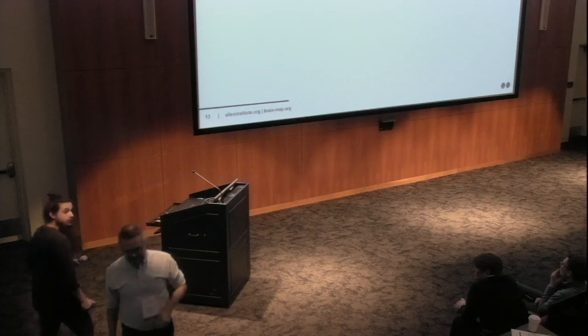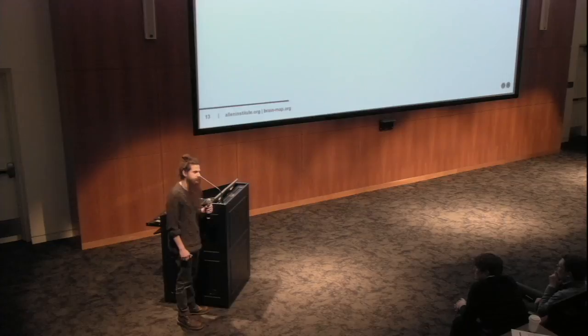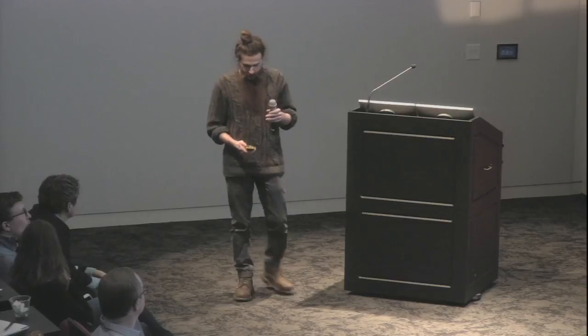Thanks. Morning, everyone. My name's Derek Britton. I'm a systems engineer, part of the manufacturing and process engineering team here at the Institute. I want to talk to you guys today really briefly just about some of the design principles we needed to modify a traditional transmission electron microscope in order to keep up with the throughput that's required for imaging a cubic millimeter.